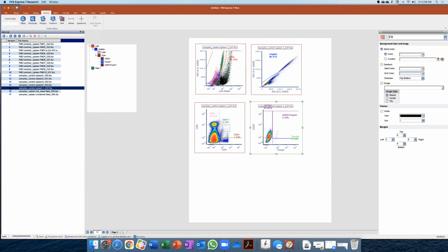And that's a great takeaway from this, to really make sure that the compensation is applied to all, because if not, that could have a pretty big impact on your files. True. Yeah, good point. And in fact, it's probably one of the reasons why it's displaying CD8 here, and not the fluorochromes, and the others applying the fluorochromes, because it could be the compensated parameter that FCS Express is interpreting, right? So again, it is important to label everything in the same way, so that when we're displaying things, we don't have these kinds of problems, right? But yeah, good point.